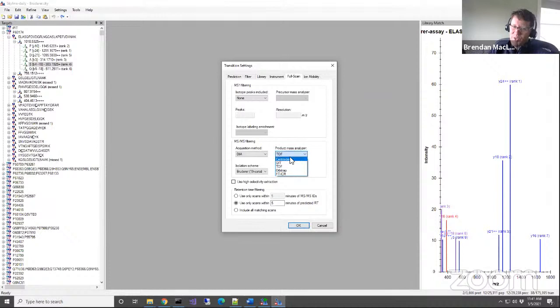I'm so sold on centroided for Thermo data that I've been thinking about adding a warning when you choose Orbitrap or FTICR for some of these algorithms, certainly for DIA. I'm sorry I can't give you a clear, single right answer. It's going to depend on your instrument platform. But go ahead and give us specifics, like, here's my instrument, what should my settings be? Post that to the support board and we can have that discussion.